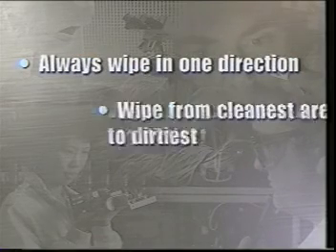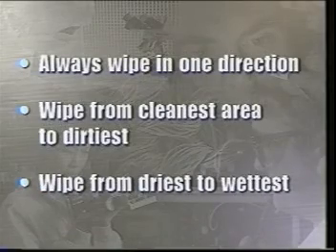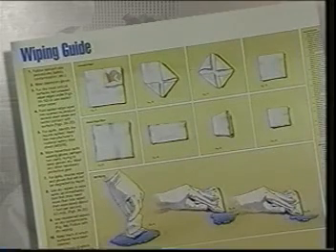So remember these 3 wiping guidelines. Always wipe in one direction, wipe from the cleanest area to the dirtiest, and wipe slowly from the driest to the wettest area.